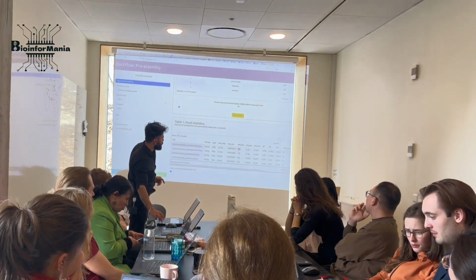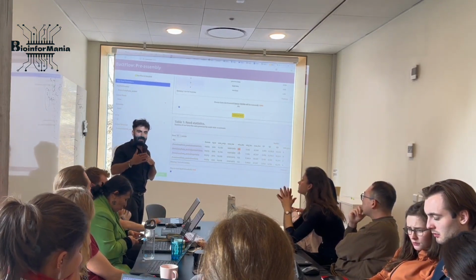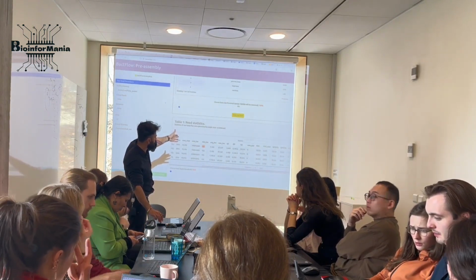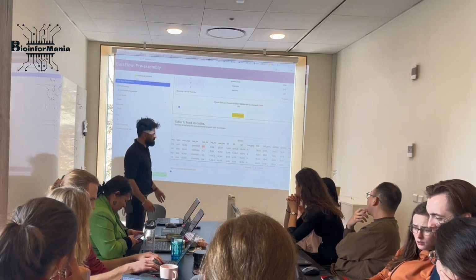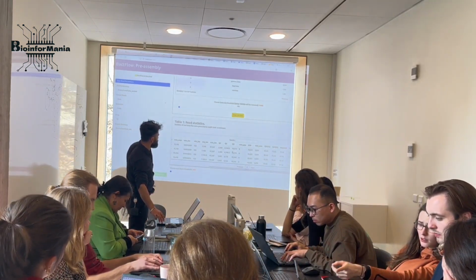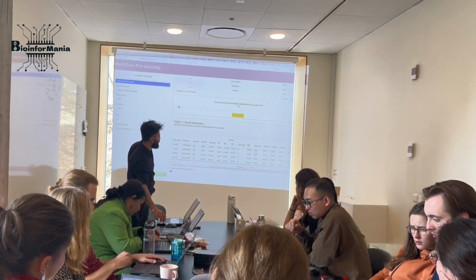And the minimum length is quite low. So later on, remember, when we decide on the criterion for choosing the minimum length, we set it to 1,000. Okay. Average length is 7,000. Max length is 47,000. And this is what I'm talking about, the length of Oxford Nanopore Technology reads. It's magical. This is the N50. So already at 10,000 it's reaching the N50, which means it's around the average length. It's fine, it's okay, it's not very shredded.